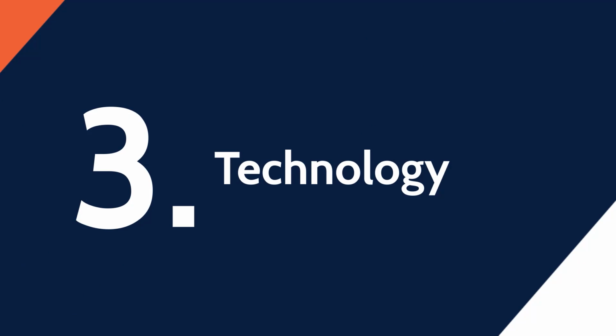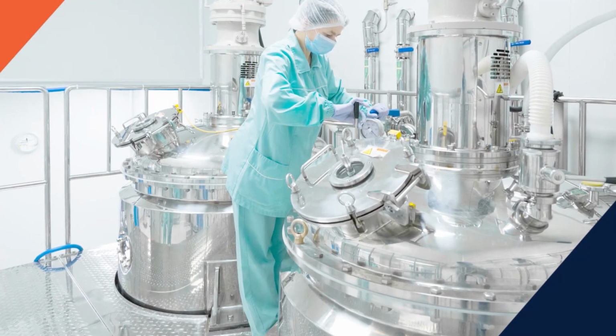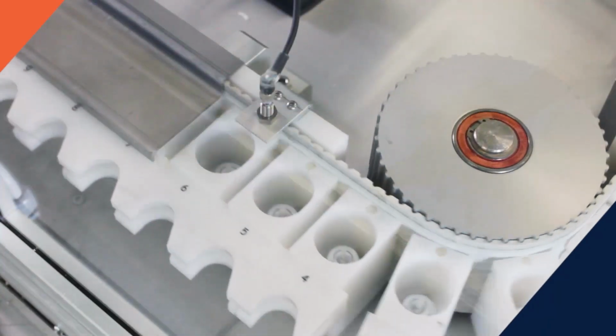Then you need technologies. The selection of instrumentation is going to be very specific. It's going to be dependent on your product type and on the CQAs, the critical quality attributes you're trying to measure. The fact you've selected the correct instrument and put it into your process does not mean you're going to get good results. You have to have the instrument in the correct position to get sampling that is representative of your process. This is critically important. We strongly recommend that you work with an instrument vendor to select the optimum instrument for the CQA and product in question.